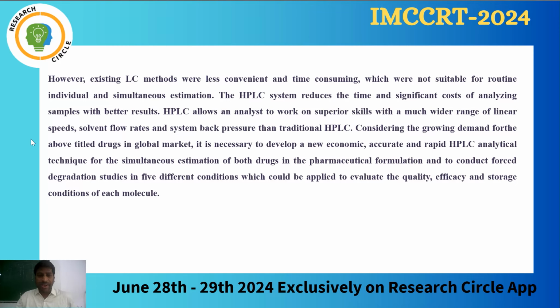Considering the growing demand for the above titled drug in the global market, it is necessary to develop a new economic, accurate and rapid HPLC analytical method for simultaneous estimation of allopurinol and Lesinurad in pharmaceutical formulation, and to conduct forced degradation studies. What is the need for these forced degradation studies? They help us find out under which condition the drug is stable. Many forced degradation studies are possible: acidic, alkali, oxidative, photolytic, thermolytic and so on. We carry out these conditions and find out under which condition the drug is stable or unstable.